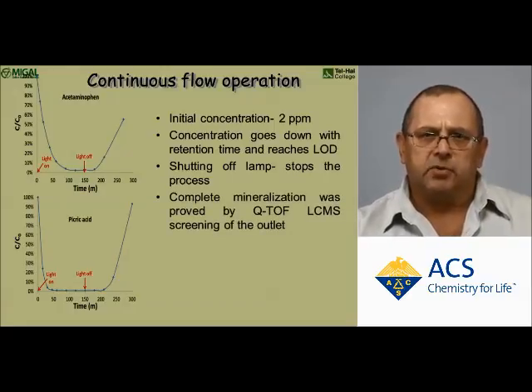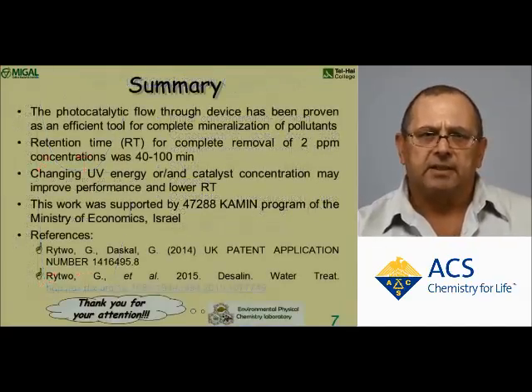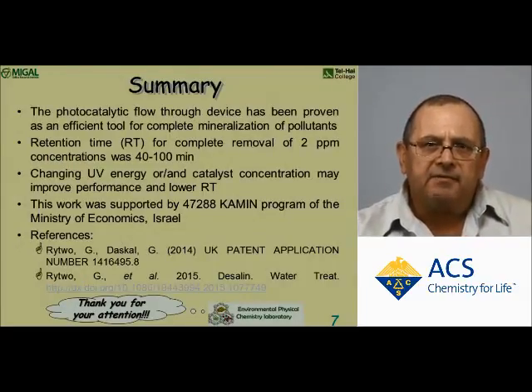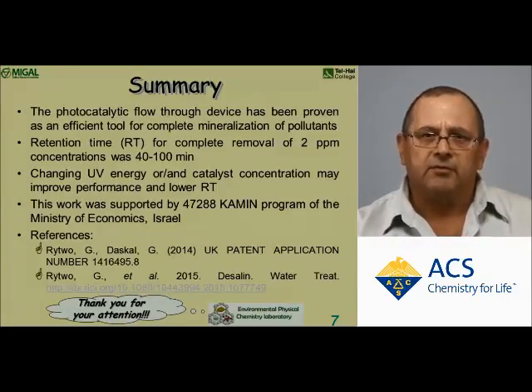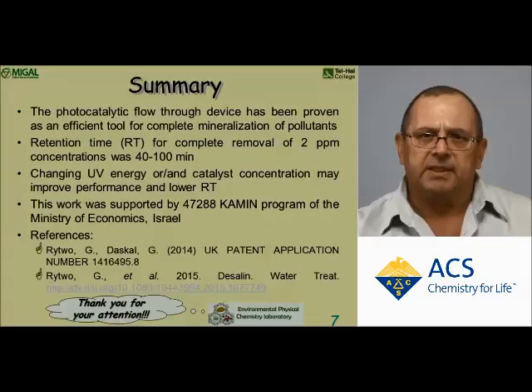We managed to prove complete mineralization by Q-TOF LCMS screening of the outlet effluent. So our device is effective and can be used for complete mineralization of pollutant. Retention time for complete removal of 2 ppm varied between 40 and 100 minutes, and can be adapted by changing the UV energy or the catalyst concentration.